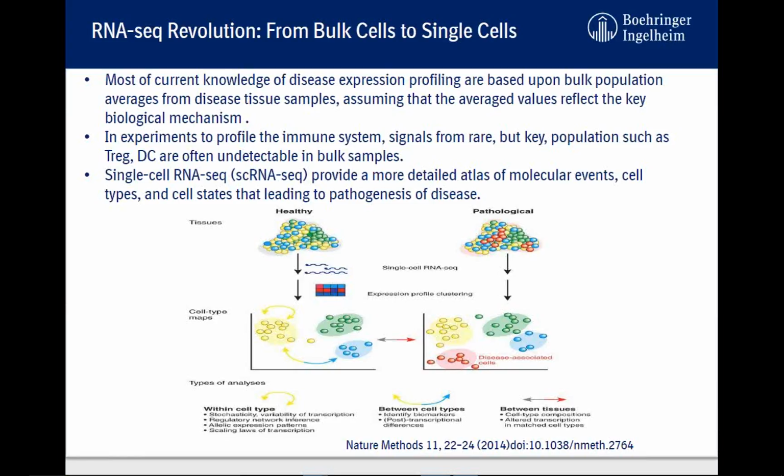Any sample from a biopsy is a mixed cell type. It could have stroma cells, a lymphocyte population, or fibroblasts. In the past, we were not able to really deconvolute. We developed a lot of bioinformatics algorithms trying to deconvolute. We can probably deconvolute it in a certain way so that we know there's a T-cell infiltration or a macrophage infiltration, but the picture is always unclear.